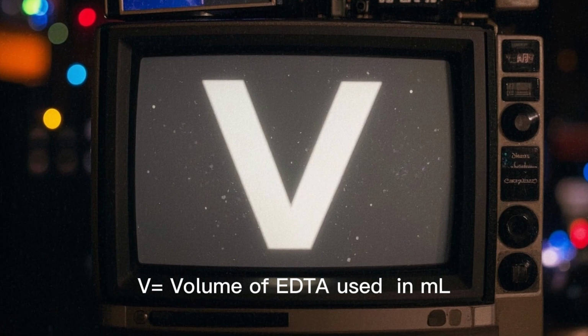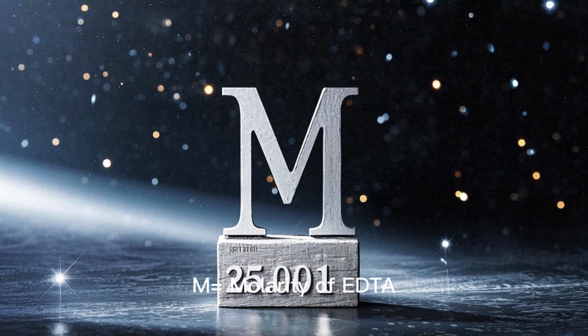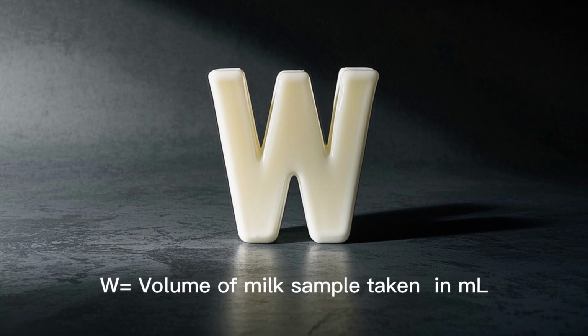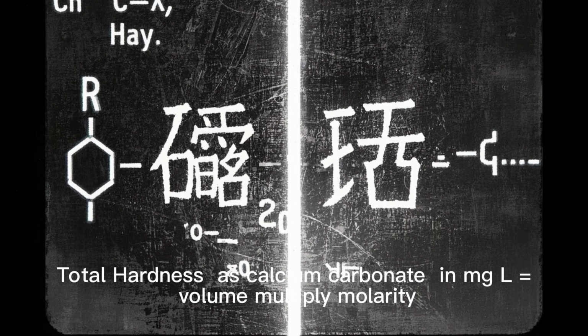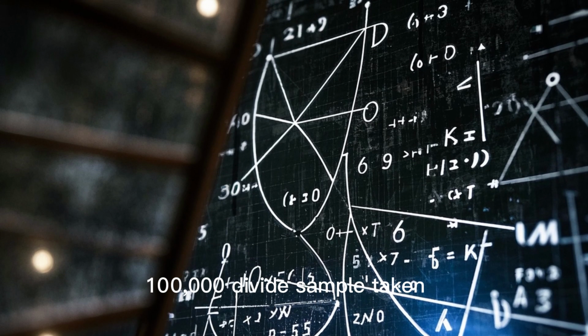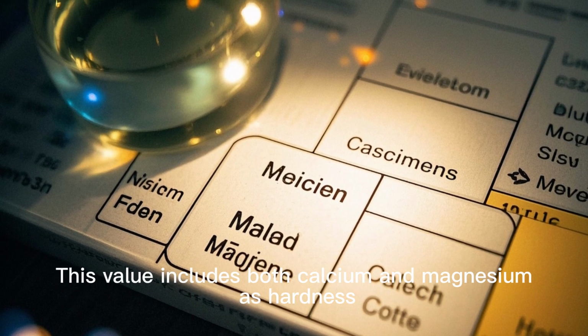Let V equal the volume of EDTA used, M equal the molarity of EDTA, and W equal the volume of milk sample taken. Formula: total hardness in mg/L equals volume multiplied by molarity multiplied by 100,000, divided by sample taken. This value includes both calcium and magnesium as hardness.